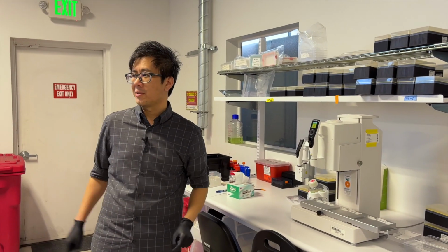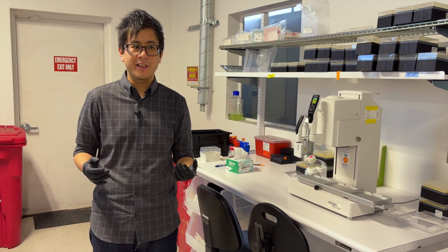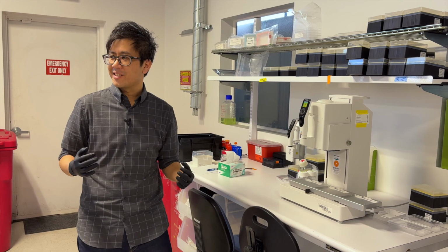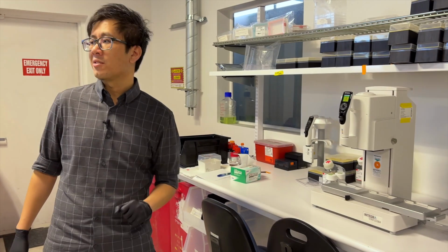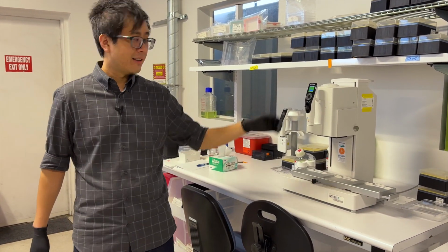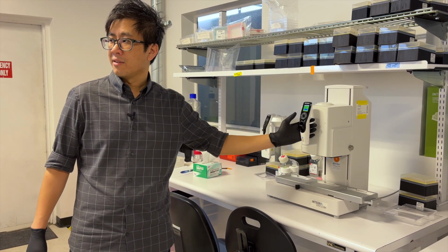of your protocols into your liquid handler and say, here's your menu, here are the things you can do. You want to give scientists the freedom to just say, I've got this cool idea. How do I use these tools myself so that I can just test out my idea right now? And little instruments like these that kind of live right at that intersection are super helpful. Because sure, you've got a 384 head, but you can also kind of just move it around yourself if you want, and kind of just manually do your pipetting.